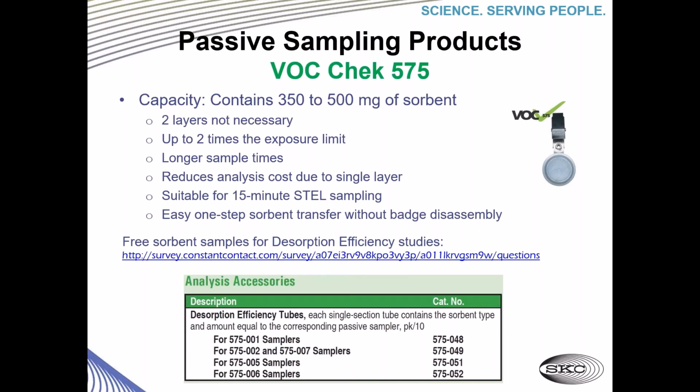However, it is suitable for 15-minute samples, and as I mentioned earlier, it was designed for easy sorbent transfer so that the lab doesn't have to disassemble the sampler to remove that sorbent. They simply remove the back, as I stated earlier, and pour out the sorbent.